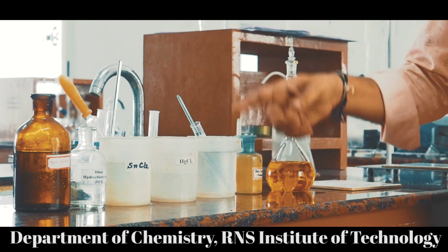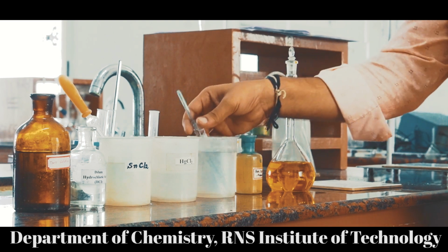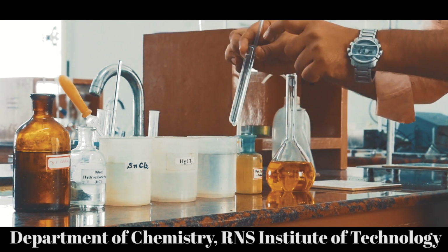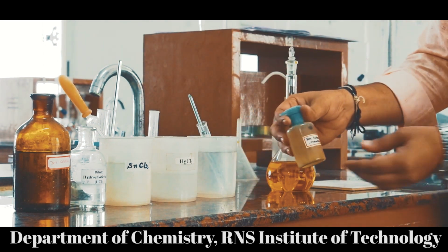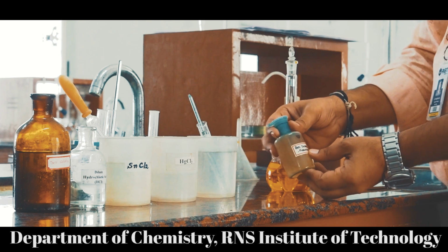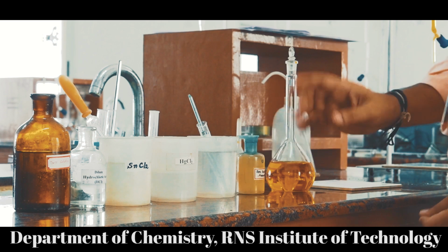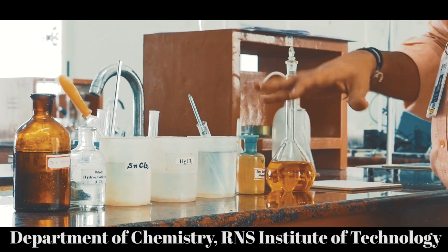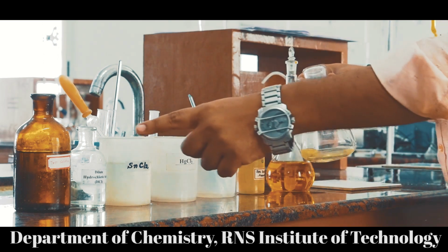And this is a beaker we need to collect from the storeroom. So in this beaker you have to take tap water, and there will be one test tube consisting of distilled water and a glass rod, right? And along with this we want the indicator, that is potassium ferricyanide. It is an external indicator. Okay, so now by keeping all these reagents or chemicals, I have prepared 25 ml of TMT bar solution.